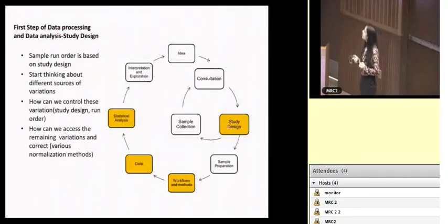Okay, so the data analysis, and we have emphasized this enough in all the talks so far, but the data analysis actually begins at the study design. This is the first and foremost important step for data analysis. We actually start processing our data the moment we design the study. And the reason is, even before we get these samples to run, we have to take into account what the factors are, how the samples were collected, whether there is a time course in the data, and how big the data set is.